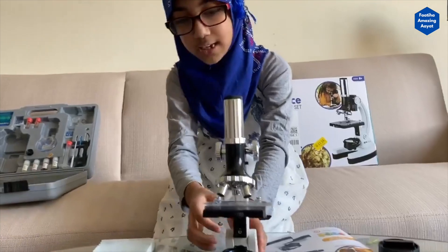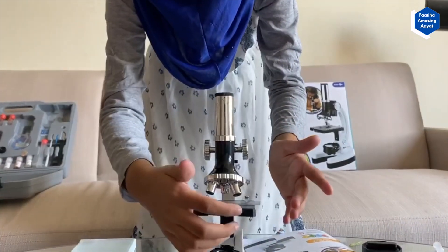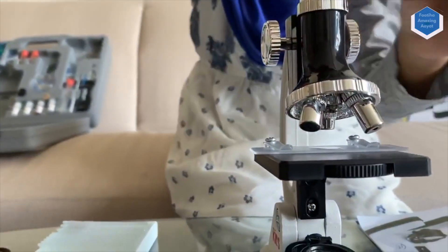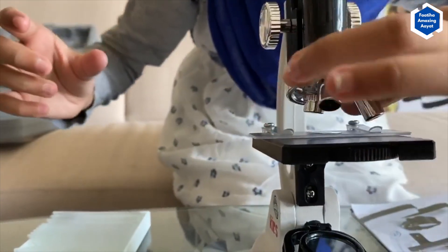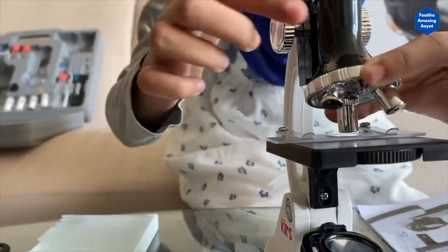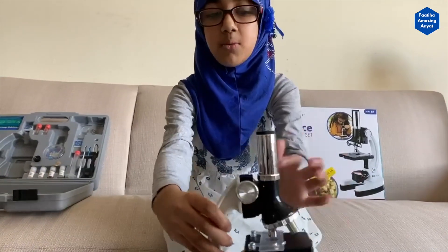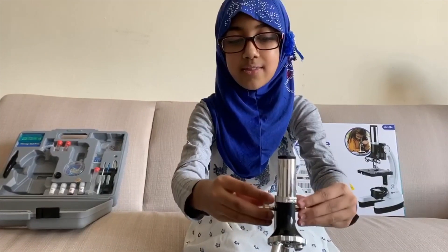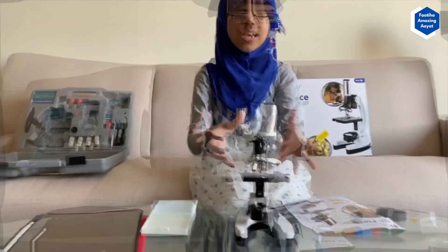Here is a color palette so you can change the filter. I can also change the lens — you can twist it and find 1,200 times magnification. Here are the focus knobs: there's one on this side and one on this side. If you twist it, you can see objects very big.